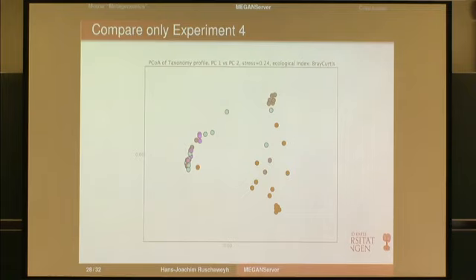Now I colored it from the time points. So brown is a time point where they just got a couple of days before antibiotics. You can see the result on the broadband antibiotics, and you can see the result of the antibiotics which were only removing bacteroidetes.